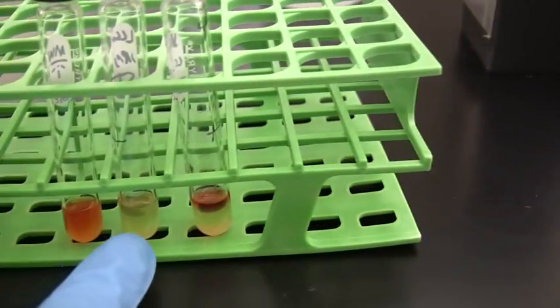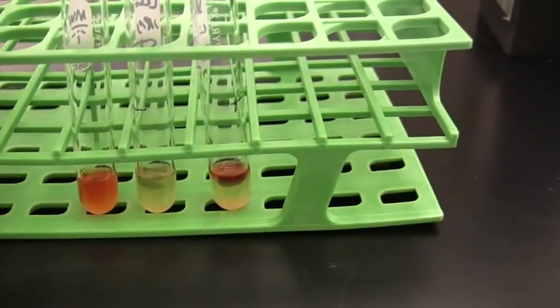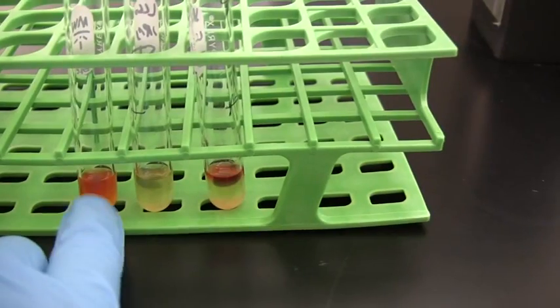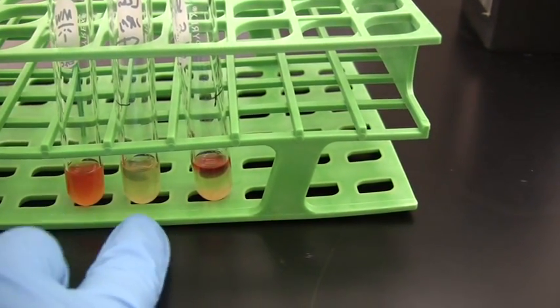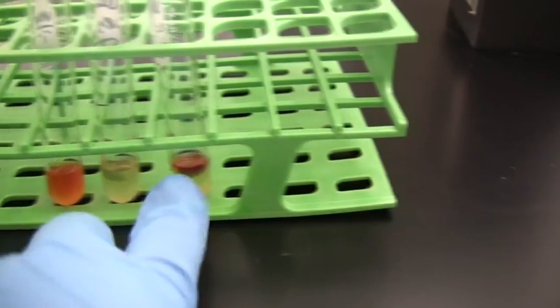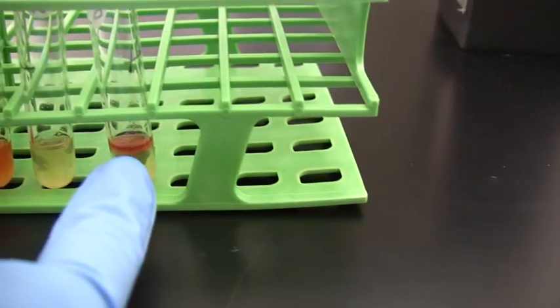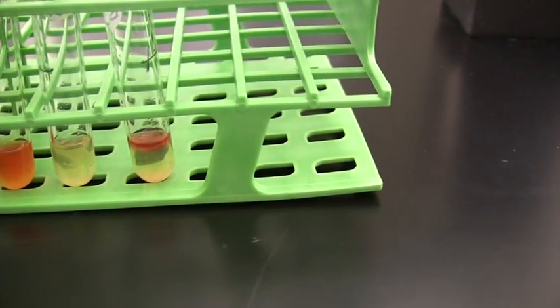Anything other than that, so little to no red, or here almost kind of an orangey red, is going to be considered a negative. And I should again see a negative here. This is a different species of bacteria, which is a slightly different change, but again I should see a negative MR test going along with a positive VP test, and the VP test appears positive by the formation of a red ring at the top of the tube after 15 minutes.